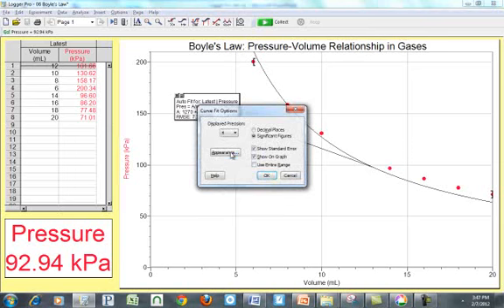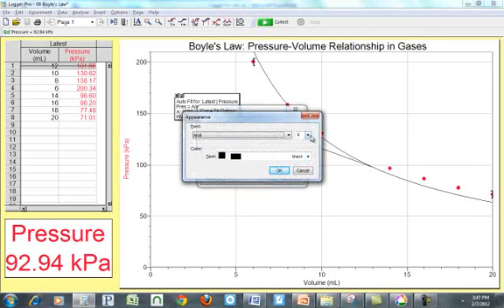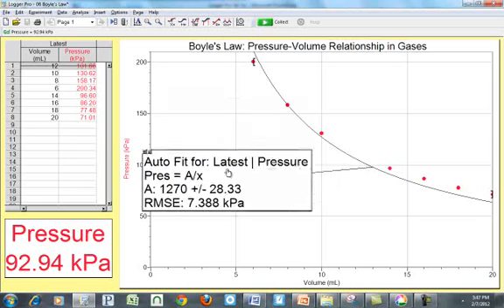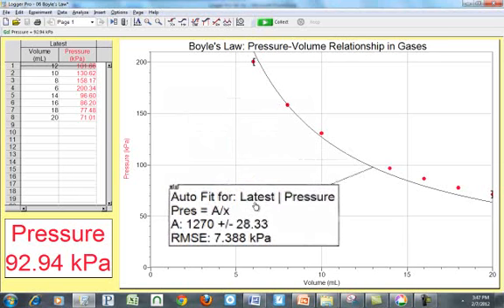So I want to change this appearance so I can read those numbers clearly. So I clicked on that. I'm going to make that a 24 font so I can read it really well. Okay, and I'm just going to move it so I can see it nice and clearly. I want to adjust my scale. So let's think about tails.